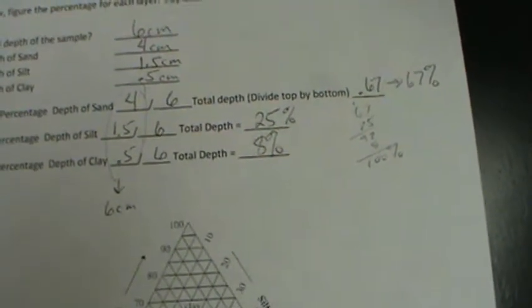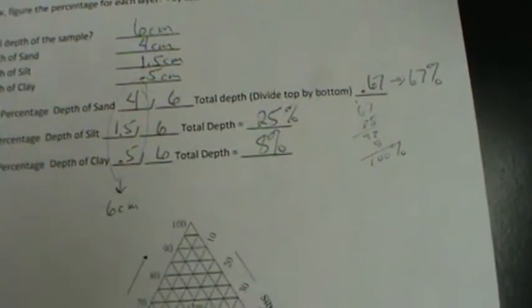If your percentages come out just under or just over 100%, say 99 to 101, because you've been rounding numbers, please don't panic. You've done nothing wrong and there's nothing to worry about.